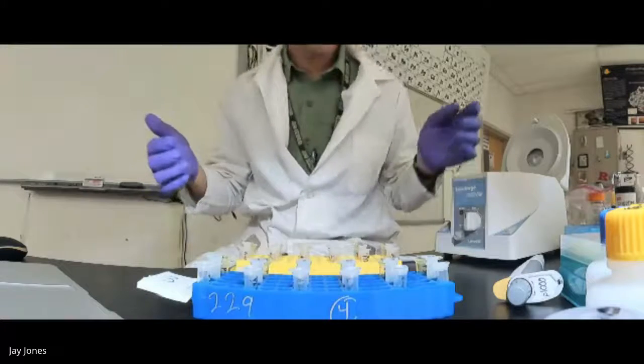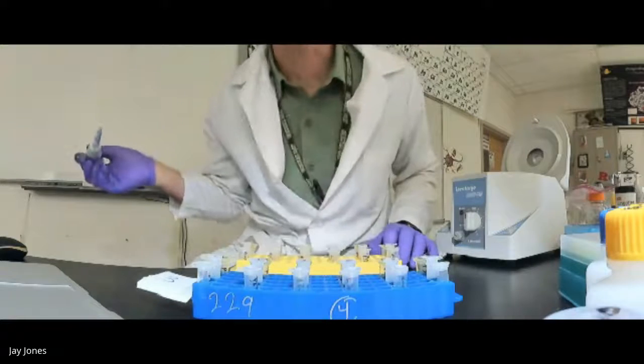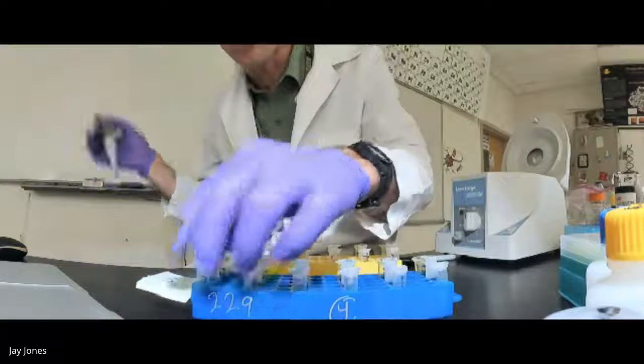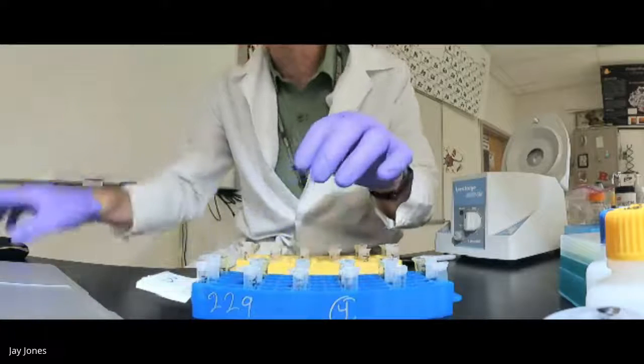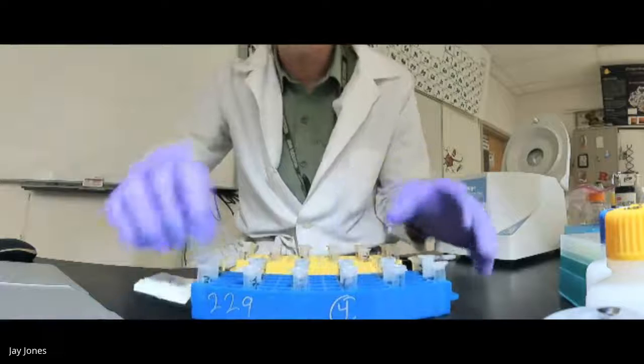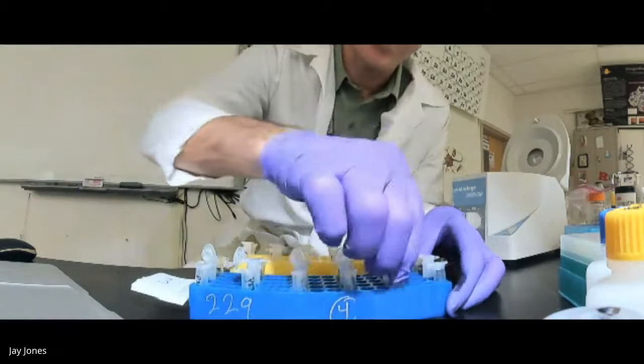All right, let's begin. So it's going to start with solution two. We're skipping solution one. Actually, we're not skipping it. We did solution one already. These cells are already in solution one. Solution one was that isotonic chelating solution that your cells were sitting in.